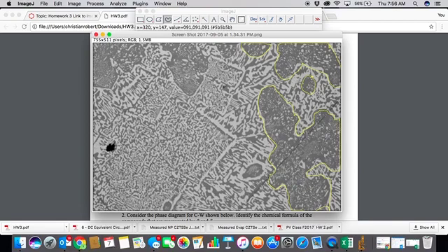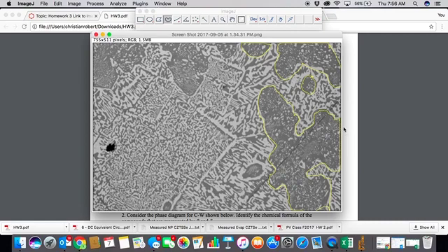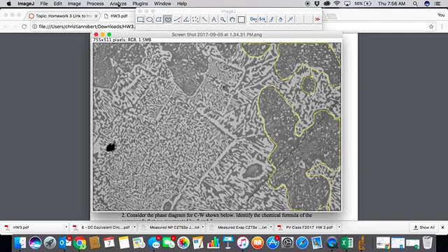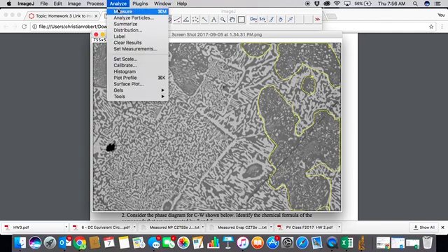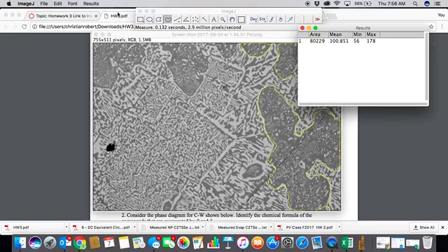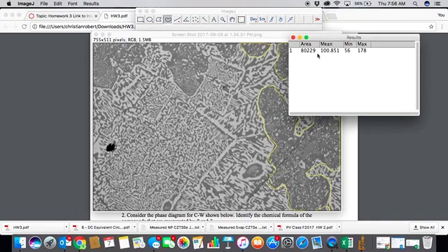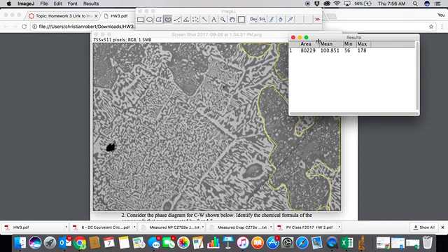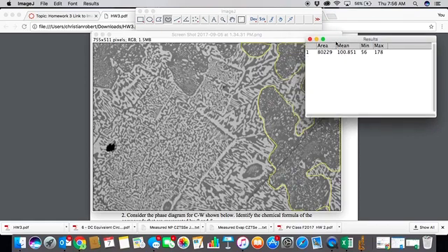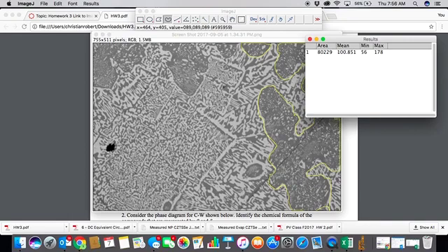And the white corresponds to bismuth. So once you have all these circled, what you can do to measure the area of these compared to the whole thing, you can go to this Analyze tool and click Measure. And what that does is it gives you this results box, and it tells you that the area of what you have selected is 80,229 pixels.